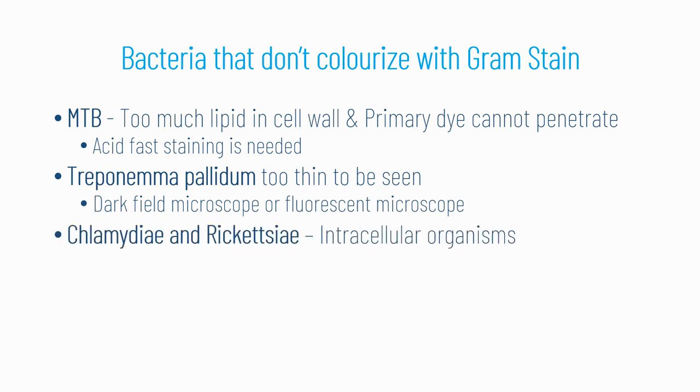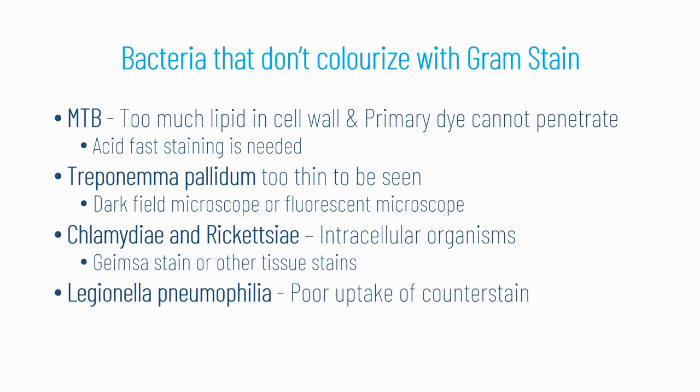Chlamydia and rickettsia are intracellular organisms. So to visualize them, we need to perform Giemsa stain or any other tissue stain. Legionella pneumophila has a poor uptake of the counter stain. So it has to be visualized by prolonging the time for the counter stain.